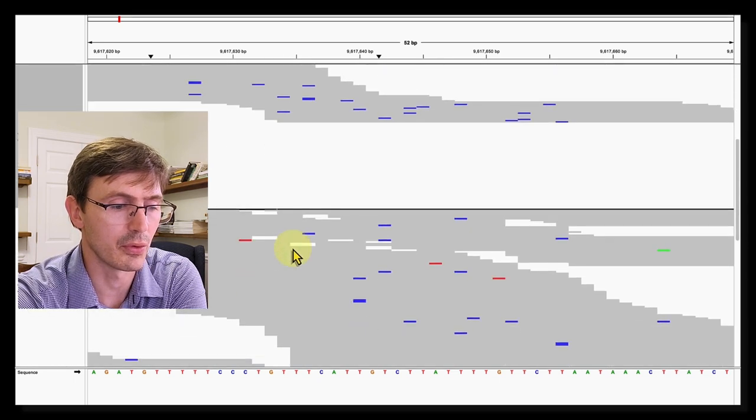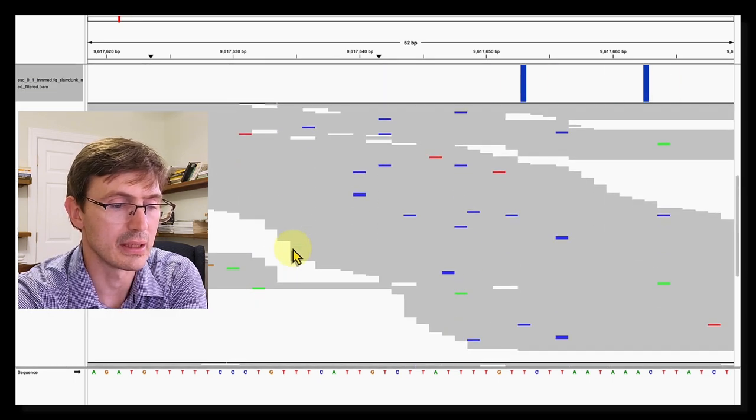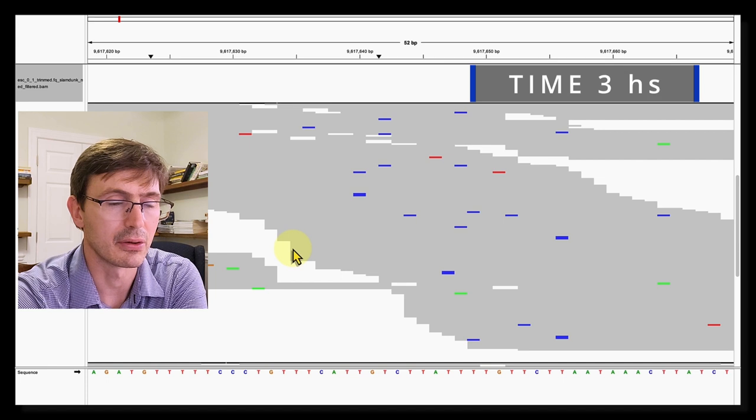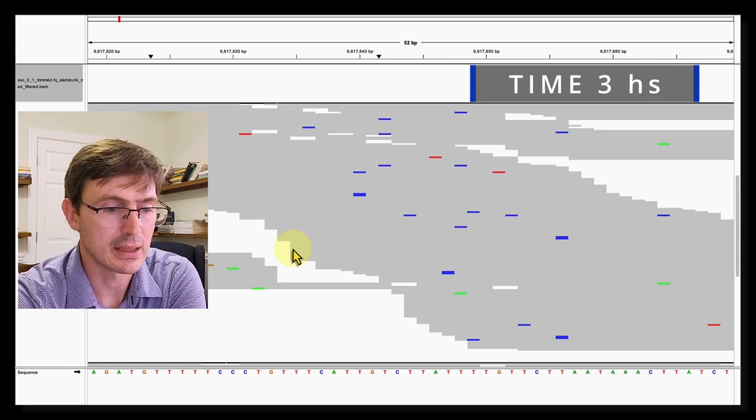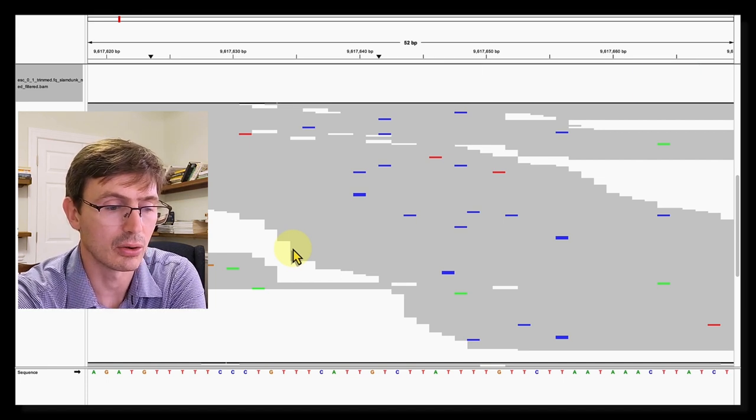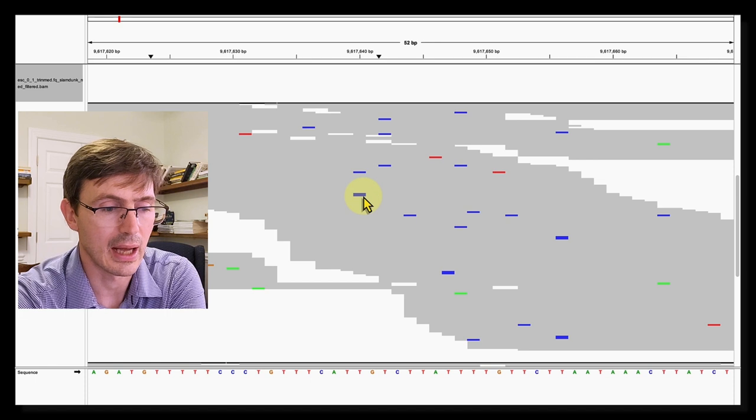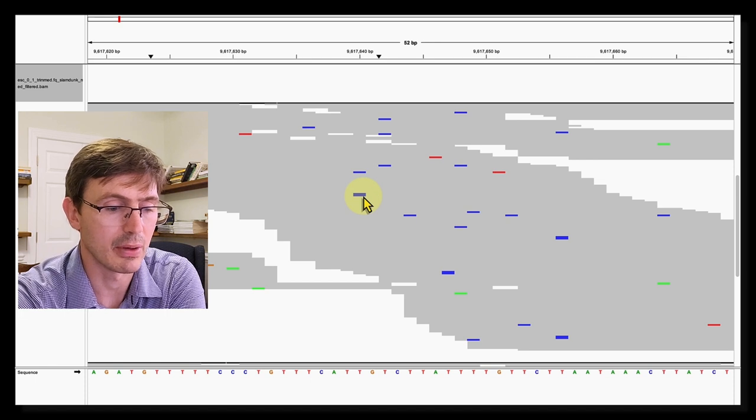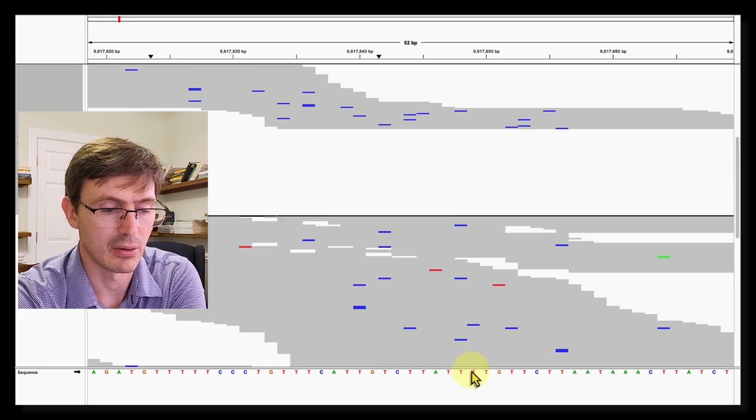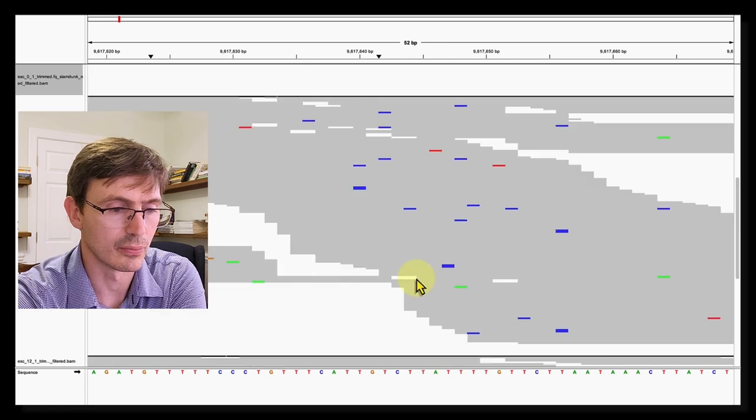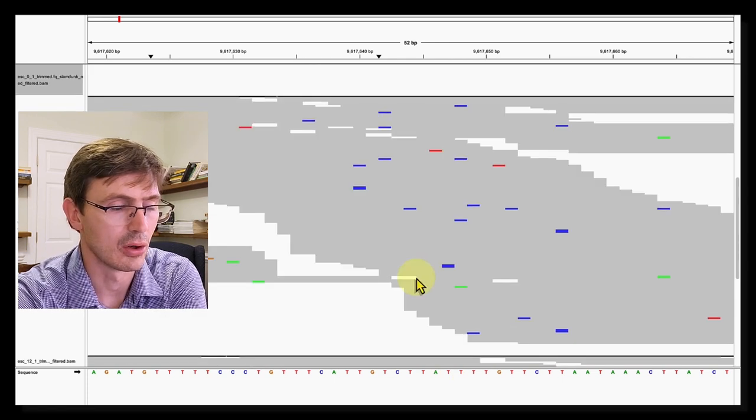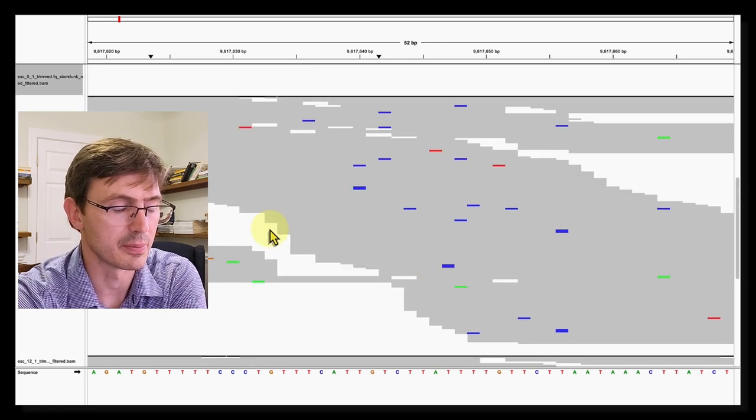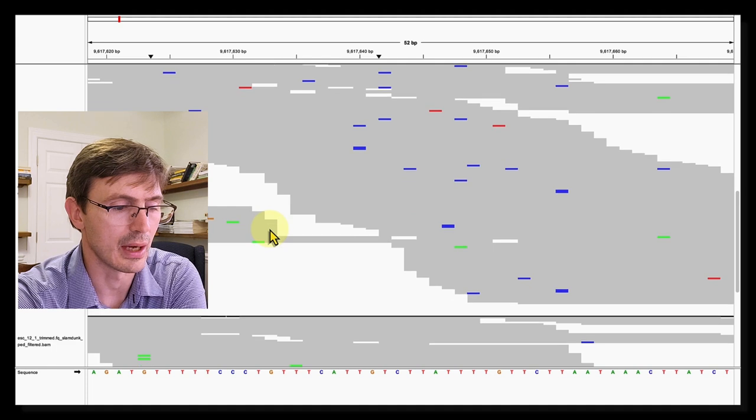Next, when we move to the alignment of the reads after three hours of the chase, we can see that there's still a lot of blue, but probably half of what we have before. And these mutations are typically originating from these genomic T's. This is in line with the half life of the transcript being around two to three hours.